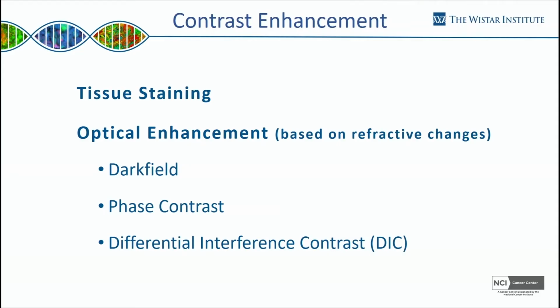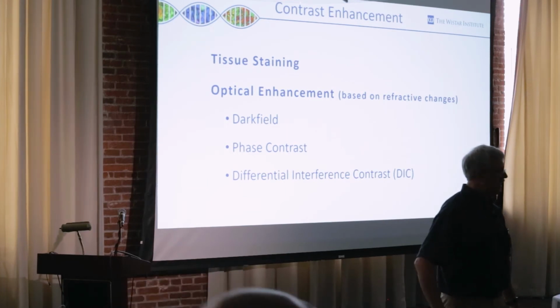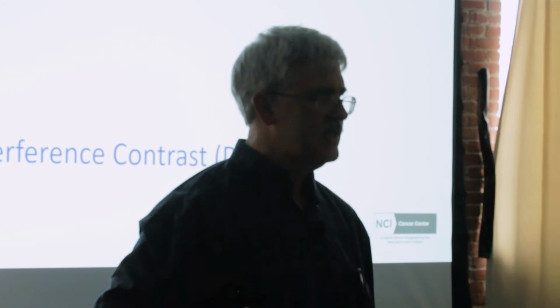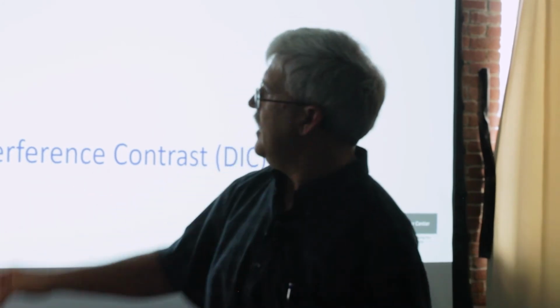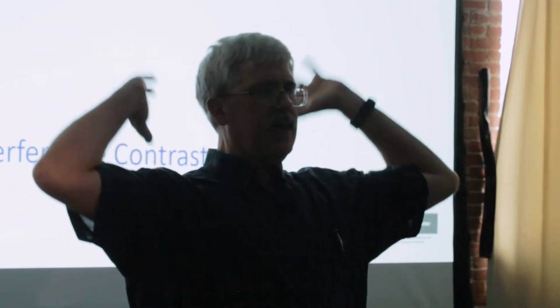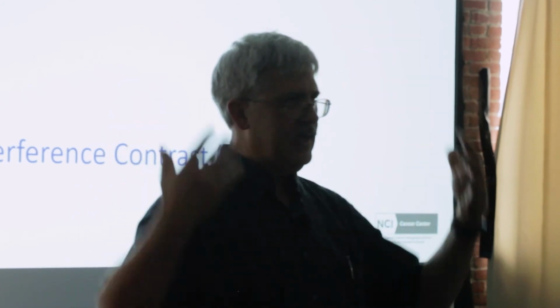Dark field. Again, Jim showed you an example of dark field before. I love dark field too. It's a great technique, and anybody can do it with a regular camera or with a microscope, because all you're really doing is putting your sample here, where I am right now. You're focusing on me. What do you see behind me? You see light. Now, what if instead we put black directly behind me? What are you going to see? I'm going to be outlined against black.